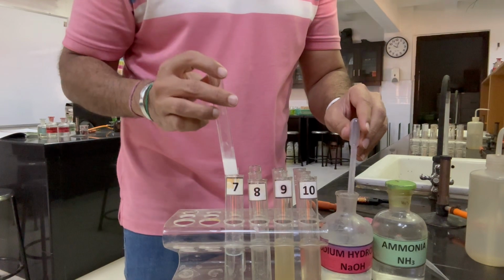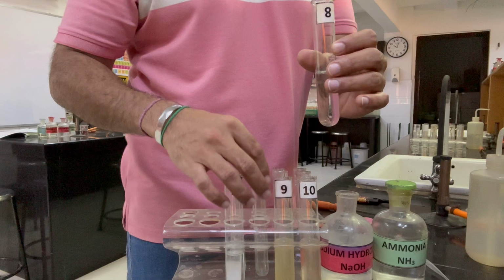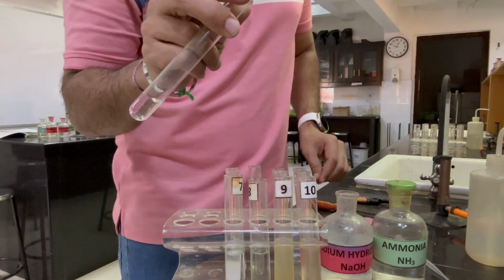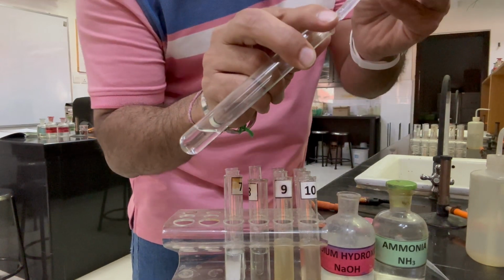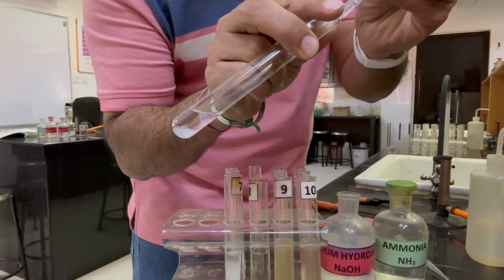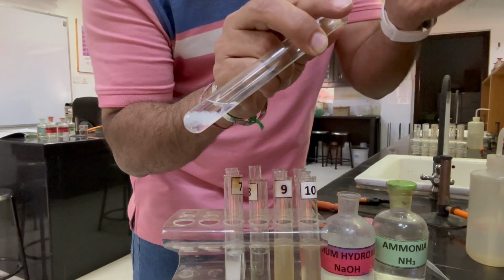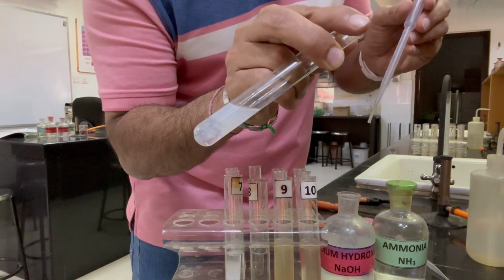Now let's move on to FA8 in a test tube, 1 centimeter depth of FA8. Again, we add a few drops of sodium hydroxide first, and we see white precipitates forming. And if we add in excess, those white precipitates are not dissolving.